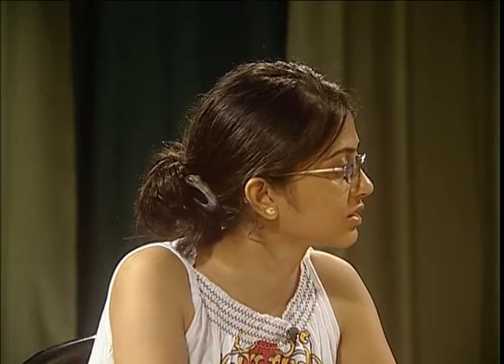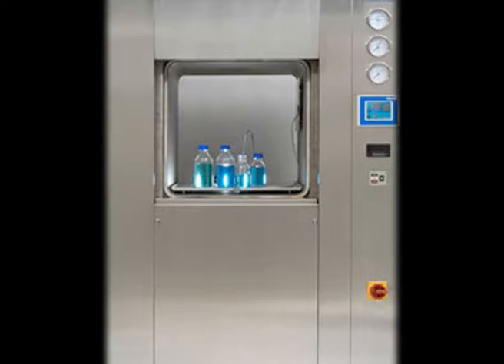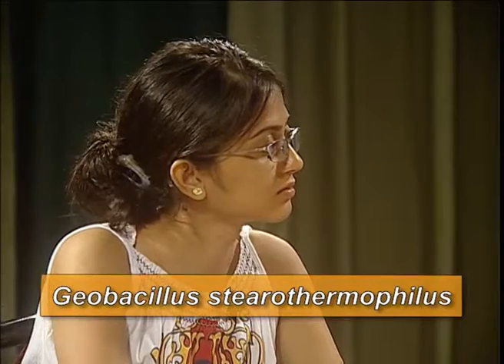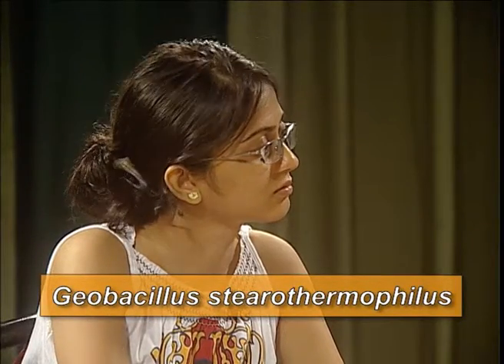Ma'am, how can we say with surety that the things inside the autoclave are perfectly sterilized or not? It is very difficult to understand whether we have reached the exact sterilizing point or not. That's why we have started using certain biological indicators. These biological indicators contain the spores of Geobacillus stearothermophilus, which is very resistant towards heat killing. So, if these spores are destroyed during autoclaving, then we can say with immense surety that the process of sterilization has been carried out perfectly.